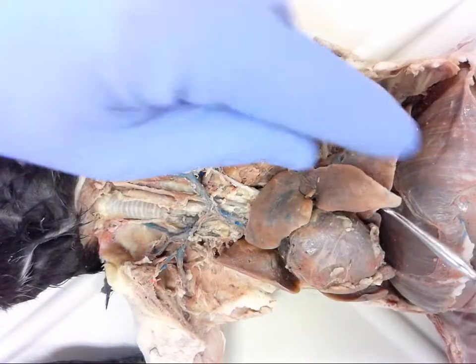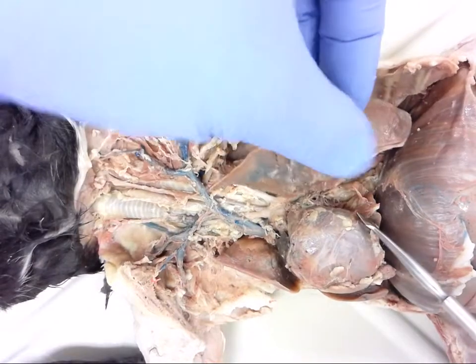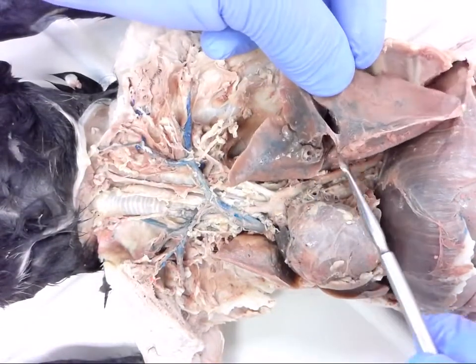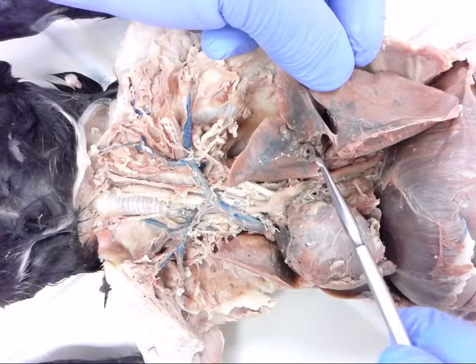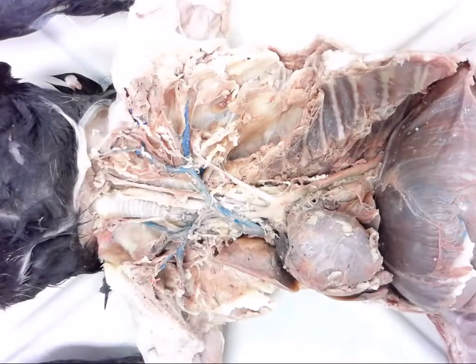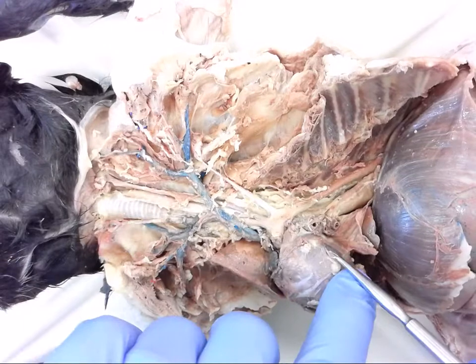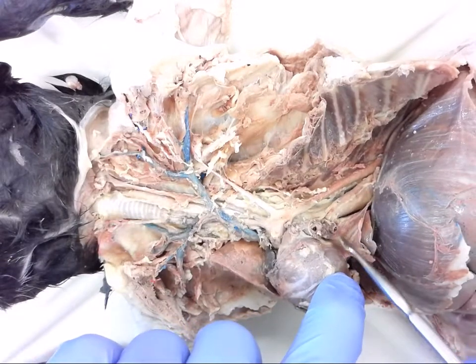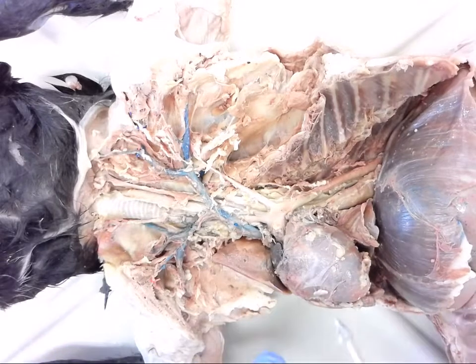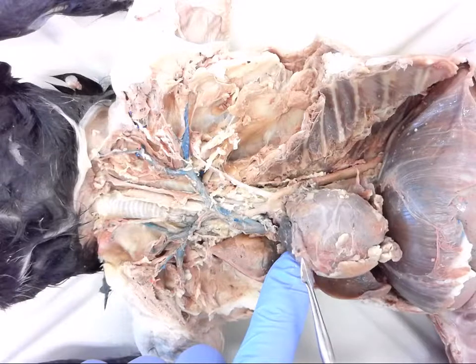I've actually removed them. They're in place now, but they have been cut, and you'll see down here at the base, you can see where the bronchial tubes come in. You can see some vessels, the pulmonary vessels that come into and out of the lungs. All right, and you can sort of see openings here as well as it goes into each lobe of the lung.